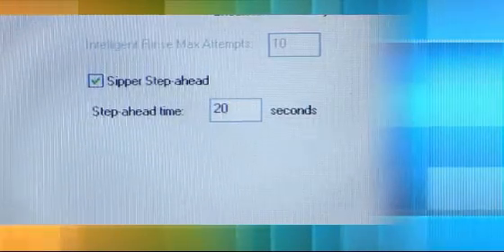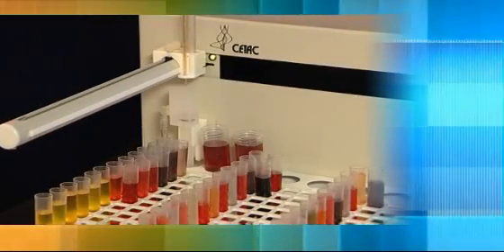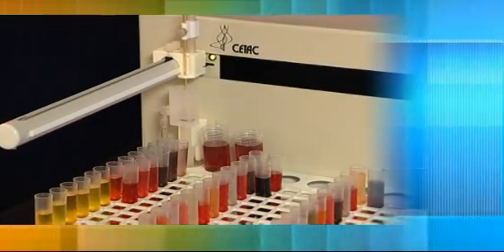Step-ahead works by moving the autosampler probe to the rinse or onto the next sample while the analysis is completed using the sample remaining in the line.